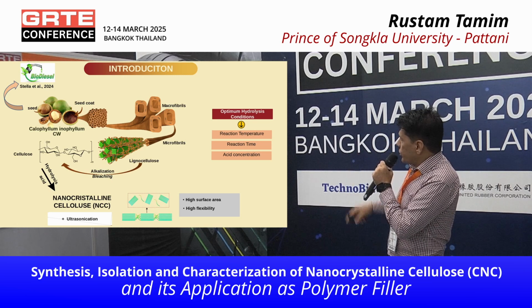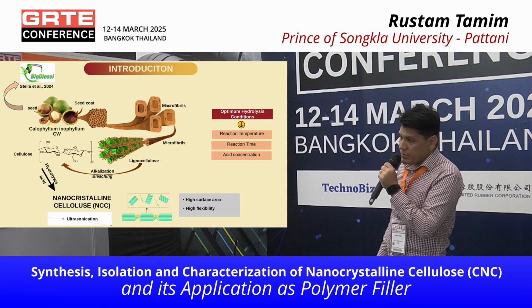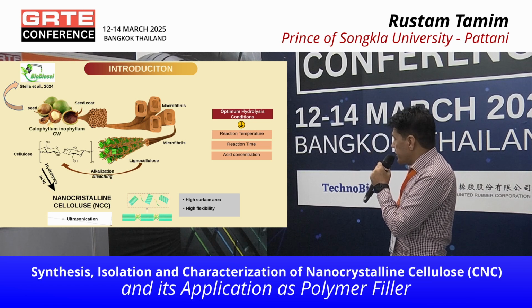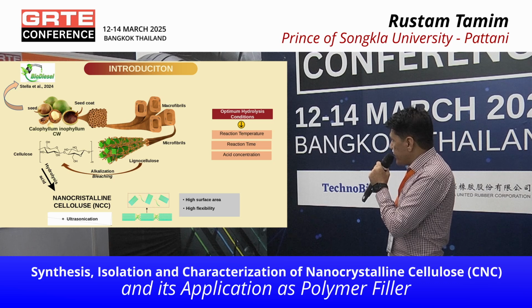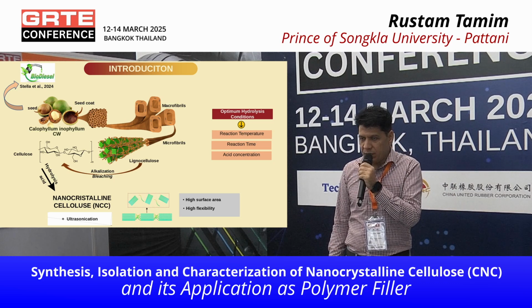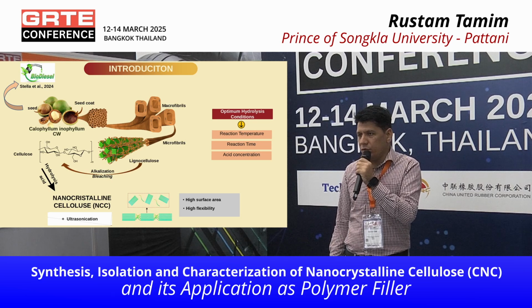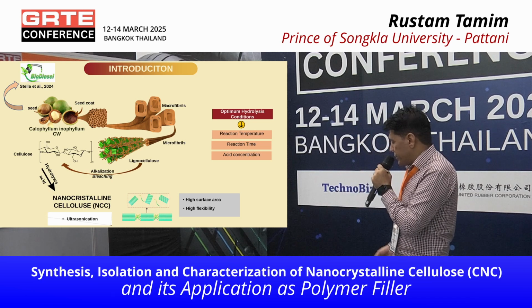In this work, the optimization points for this research were reaction temperature, reaction time, and acid concentration. For the hydrolysis, we use acid, so we use different concentrations of that acid and optimize that part.